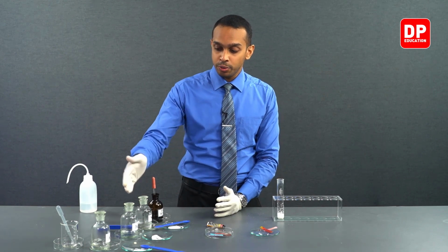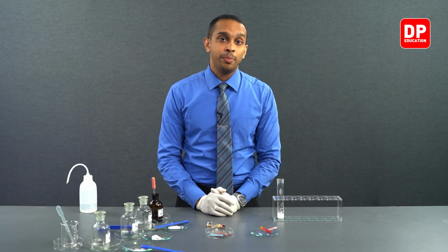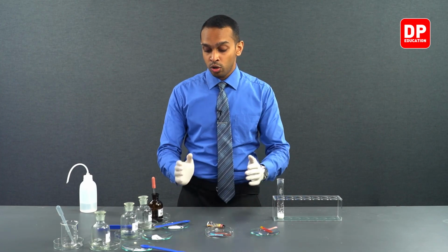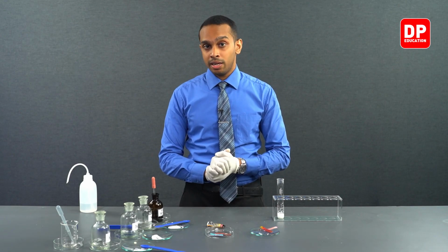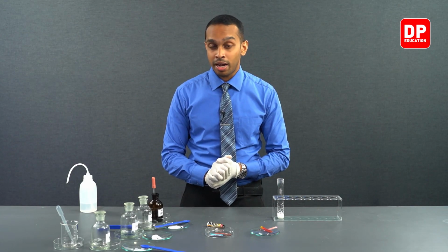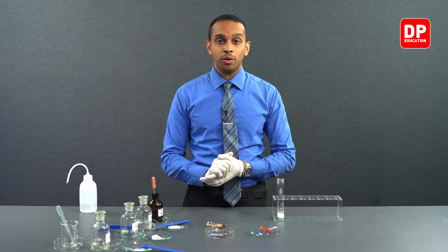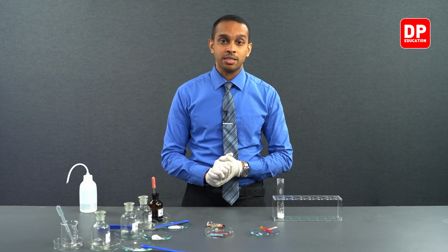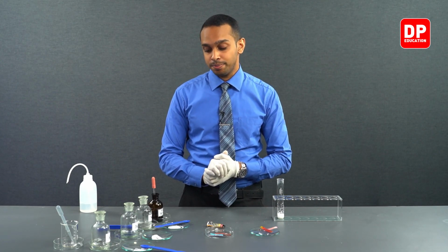But the other two halides, bromide ions and iodide ions, can be identified by the color of the gas that is evolved. If a purple color gas evolves, that solution would have contained iodide ions. If a brown color or maybe orange color gas is evolved, that indicates the presence of bromide ions.